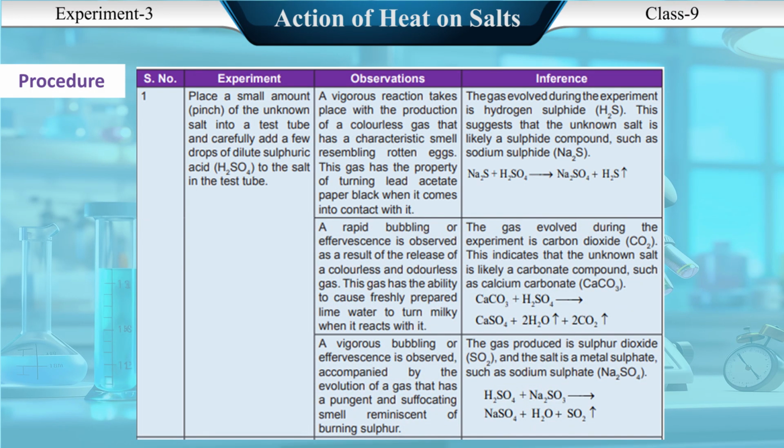A rapid bubbling or effervescence is observed as a result of the release of a colorless and odorless gas. This gas has the ability to cause freshly prepared lime water to turn milky when it reacts with it. A vigorous bubbling or effervescence is observed, accompanied by the evolution of a gas that has a pungent and suffocating smell reminiscent of burning sulfur.